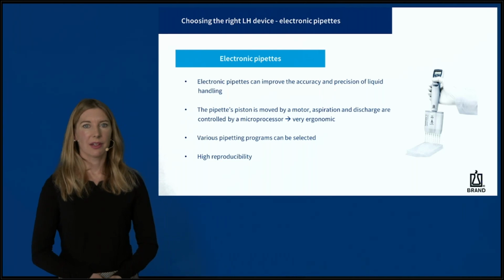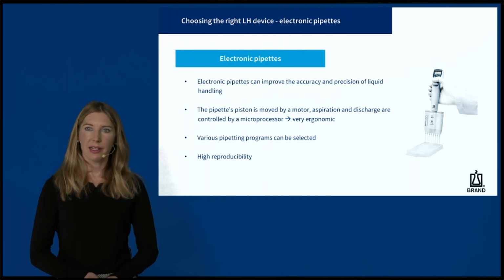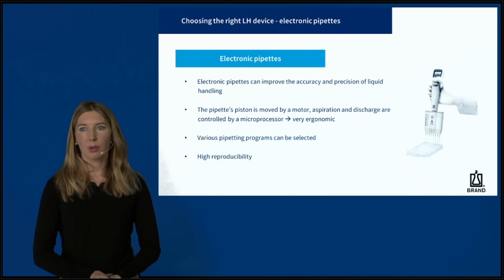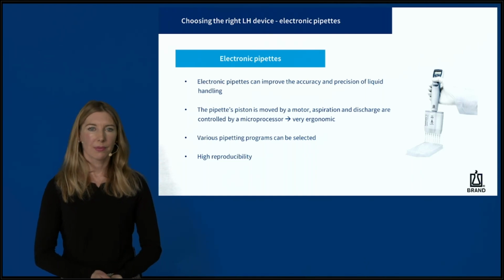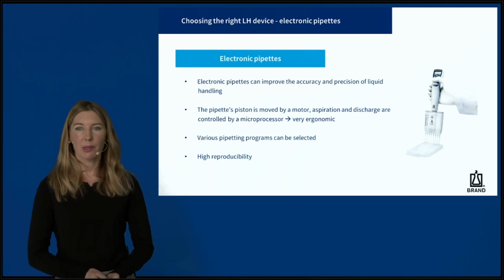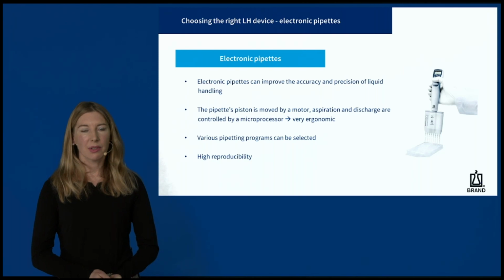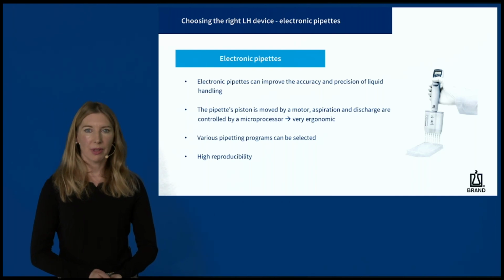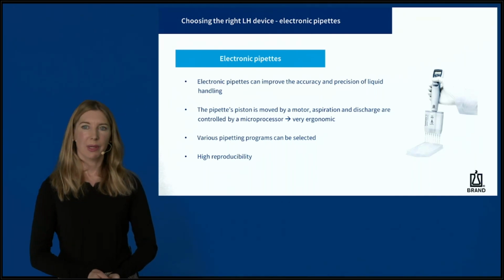An additional advantage is the execution of pipetting programs, such as the gel electrophoresis mode, a precise display of delivered volume, reverse pipetting, mixing, and a dispensing mode, which are not possible with manual pipettes. By dispensing the reagents in a specific order and volume with the help of the different programs, the risk of errors can be reduced. Another advantage is the high reproducibility, as operation forces do not have an impact on the volume.